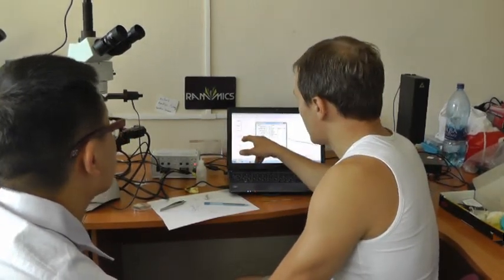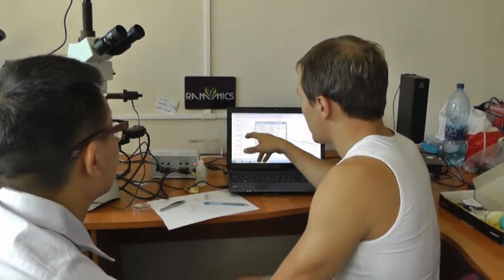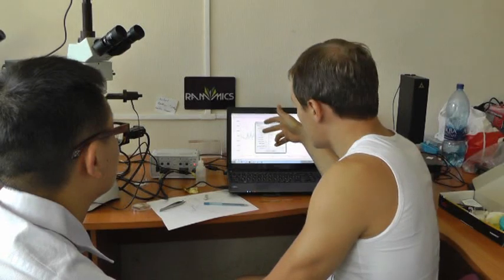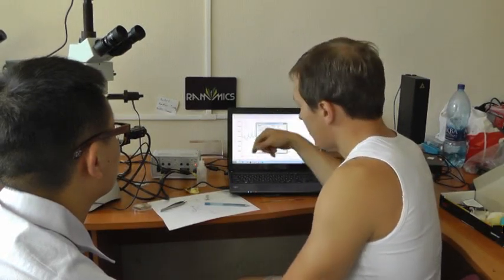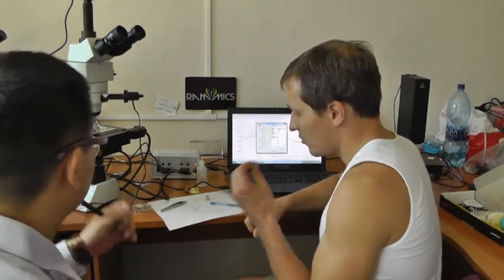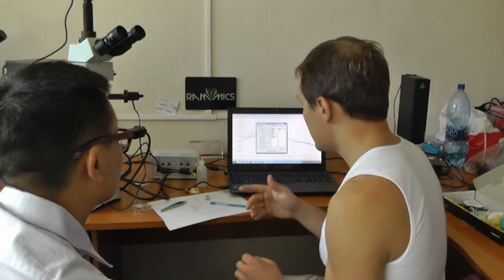That's why even spectra of paracetamol are different from each other, and before combining them into a group called paracetamol, we need to compare them with each other, and if their mutual correlation exceeds a threshold value, they will be combined.